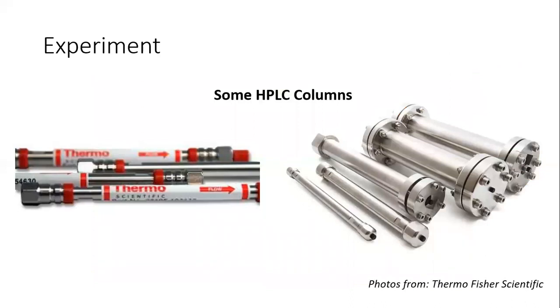So these are examples of some HPLC columns. Okay, so kung maalala nyo kanina yung sa GC, different sila. Okay. So, sa GC, naka-round off, naka-coil sila, tapos manipis yung column. For the HPLC, medyo makapal siya, tapos mahaba. Okay. So nakapack dito sa loob yung inyong stationary phase. Okay.